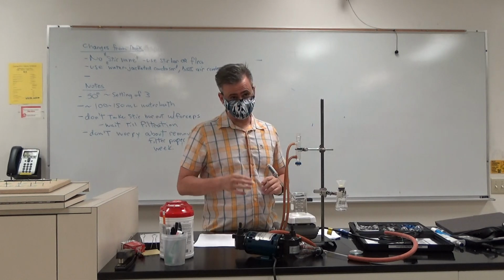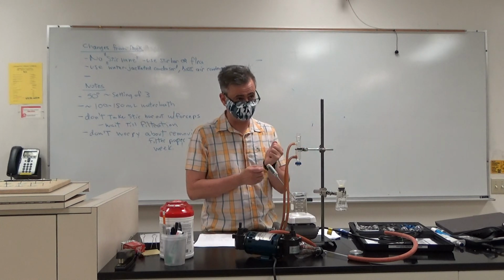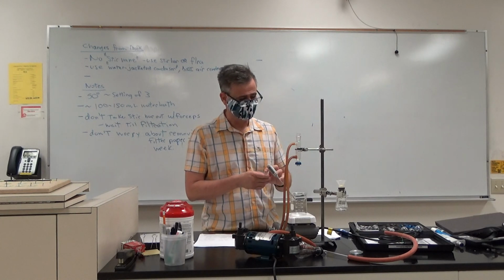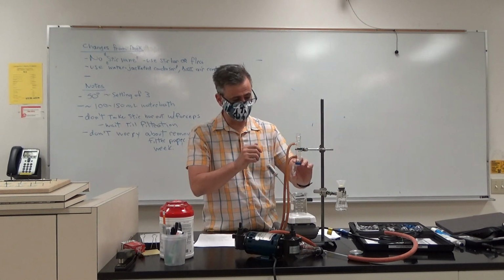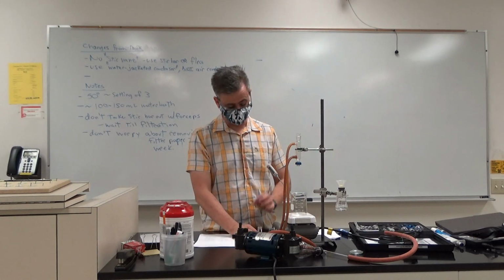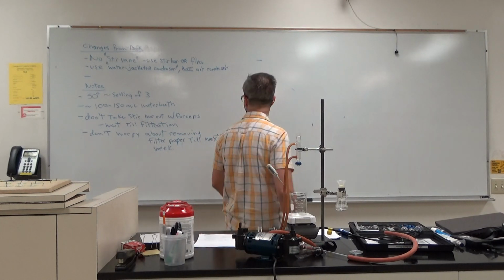This isn't a good situation to use that technique, and I don't really like that. It actually introduces a tiny bit of danger because those stir bars, those stir rods can crack, and again, you can slash yourself. So eventually you're going to add 3 mils of water to this, right? If you don't have any crystals that have grown, set this down into another beaker and then start to add your water, and boom, you'll get crystals. Okay? Does that make sense? Am I right, don't scratch?